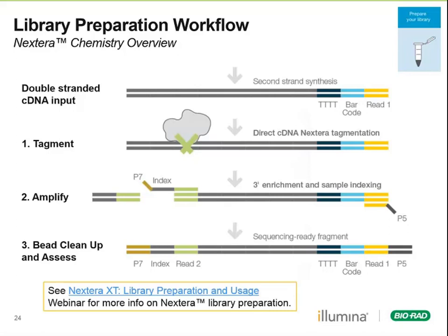Now, I didn't cover very much about the Nextera workflow, so if you'd like to learn more, we already have a great webinar for our Nextera XT preparation, which goes into the details. You can use this link to learn more. Just keep in mind you're going to want to use the conditions for the specific kit you're using laid out in the reference guide.